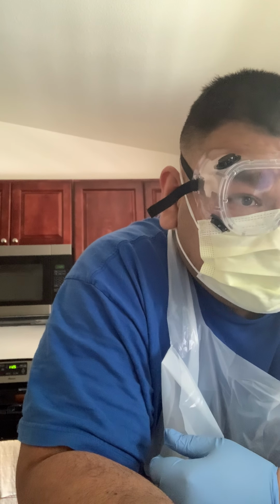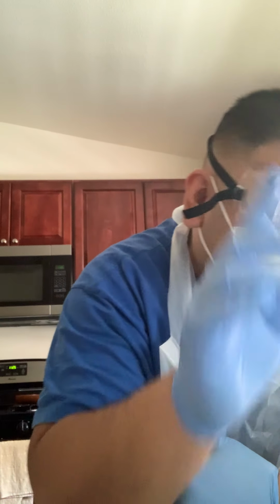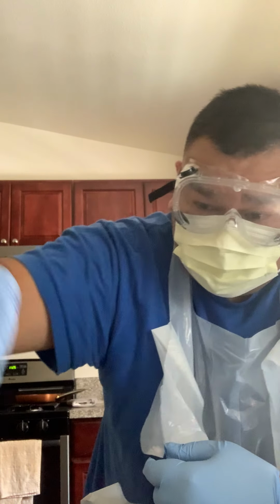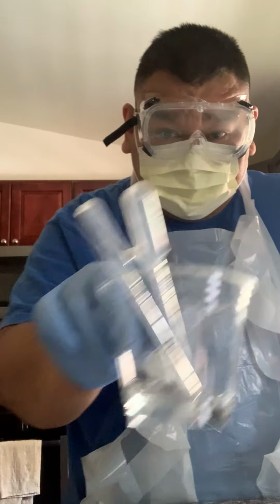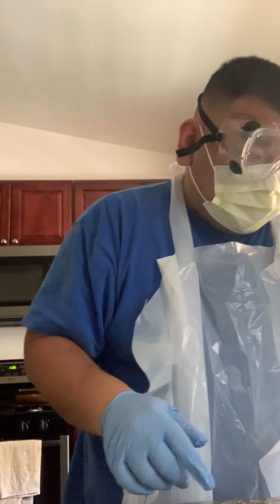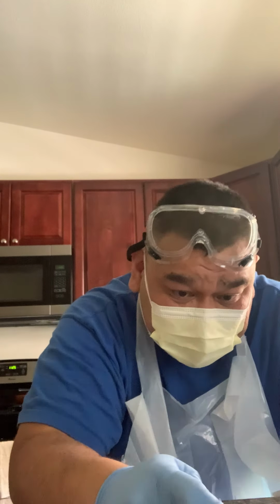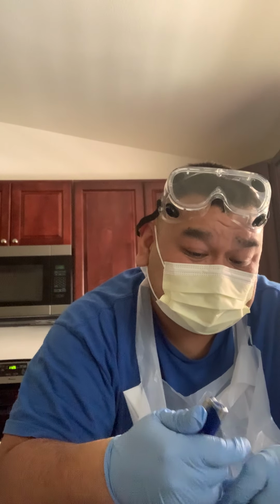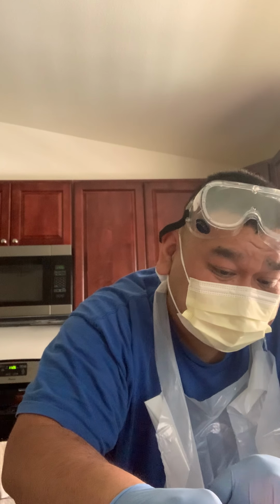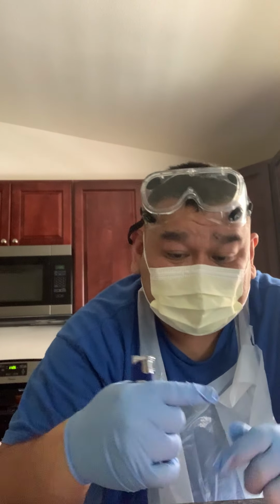Place two dropper pipettes in a disposable cup of alcohol. Then light a candle. Oh, I can't see. Sorry, I couldn't see with the goggles. Almost burned my gloves off.